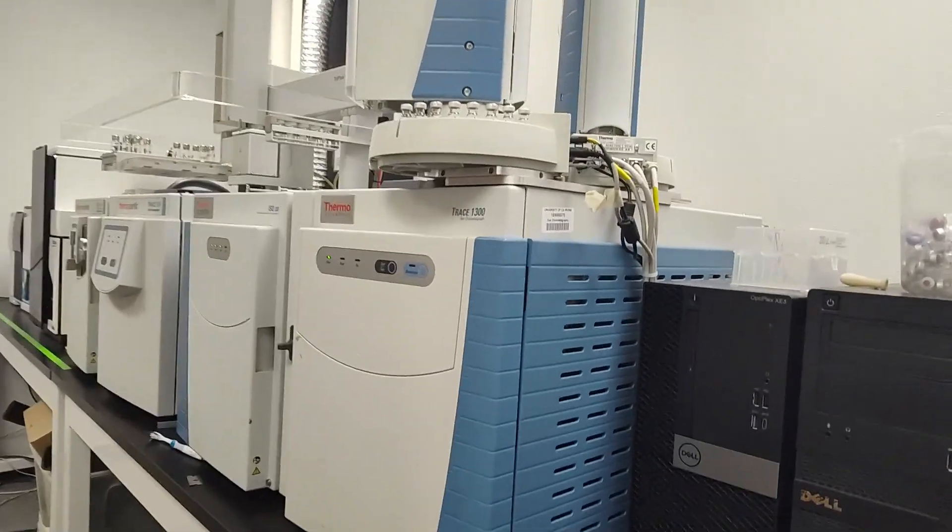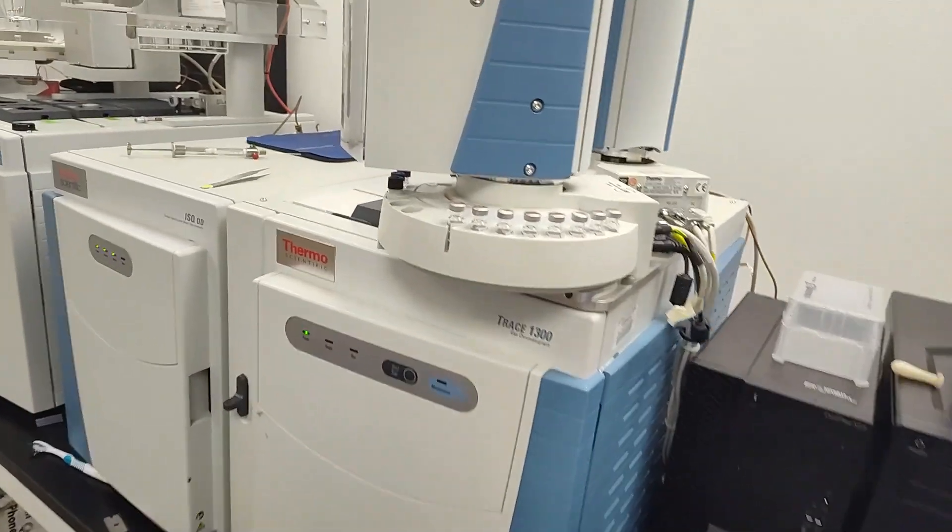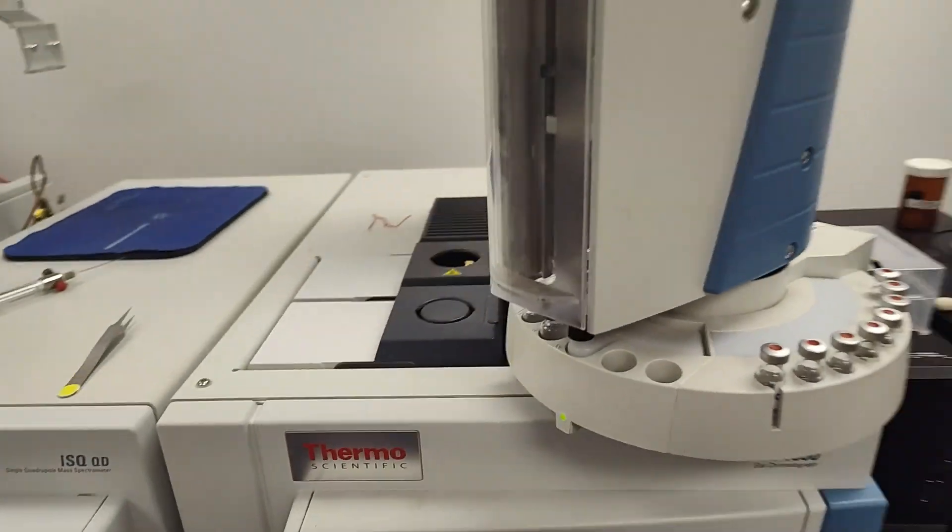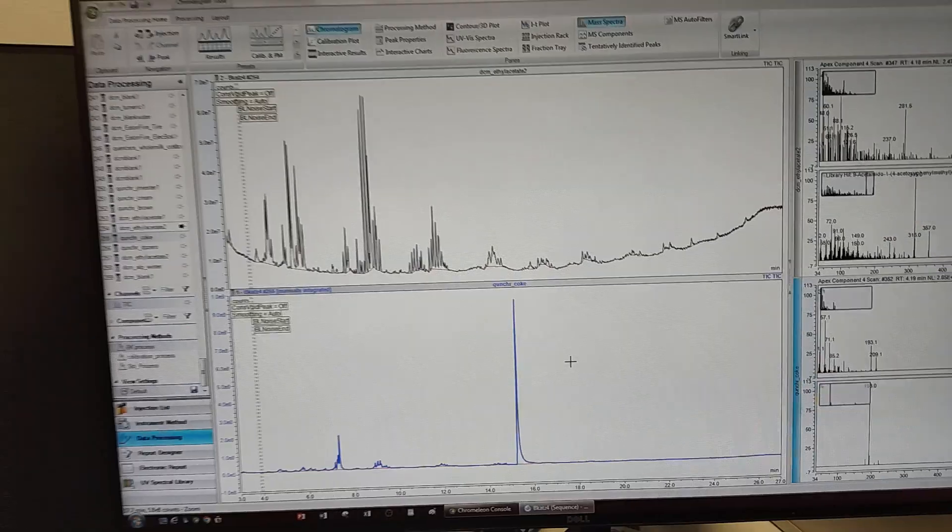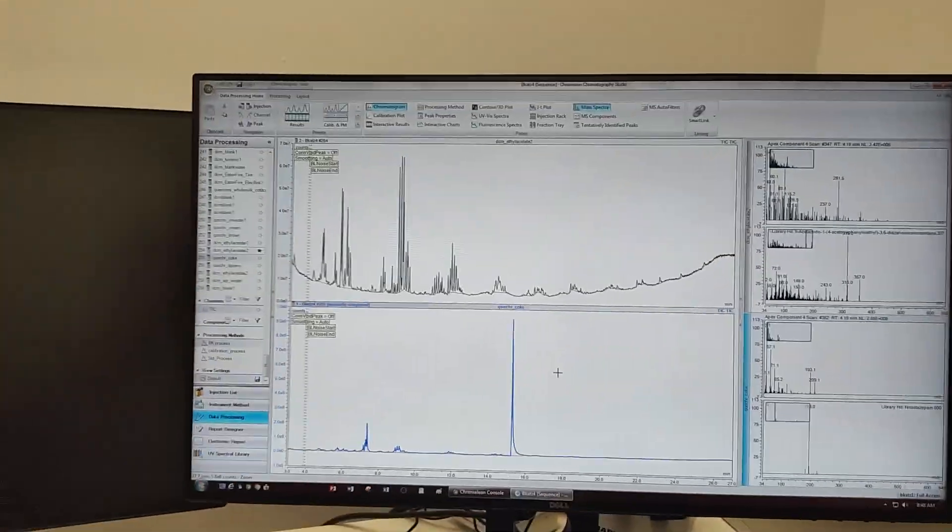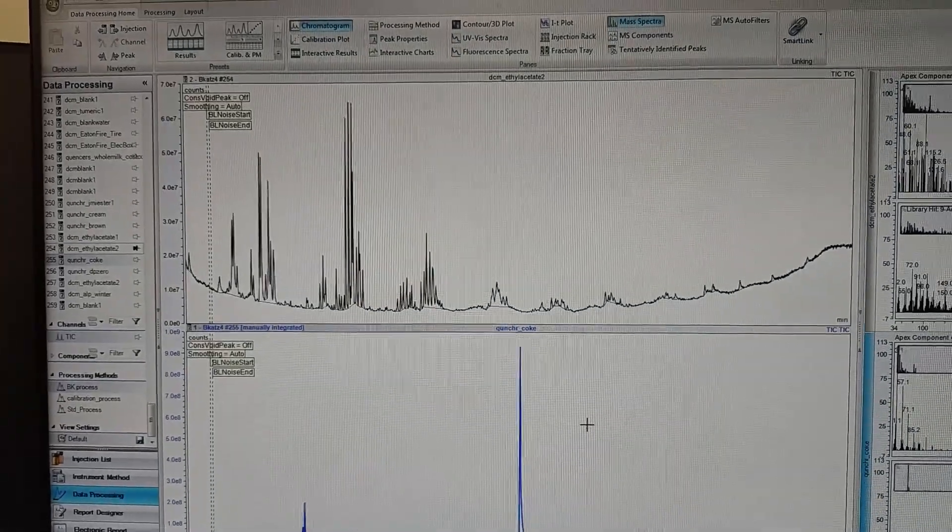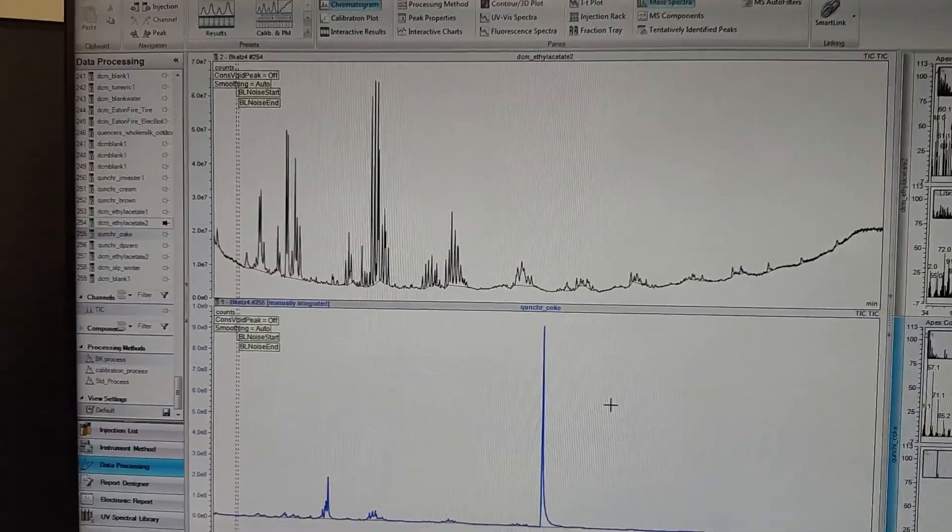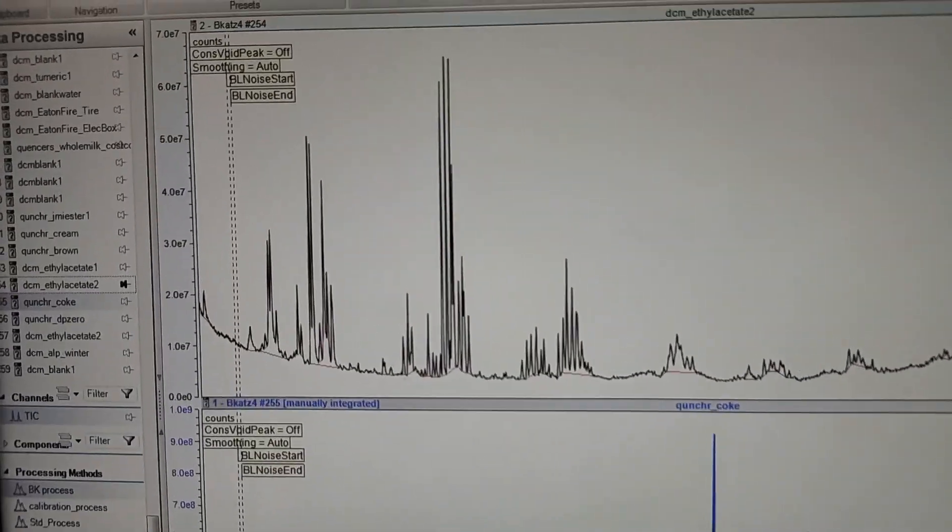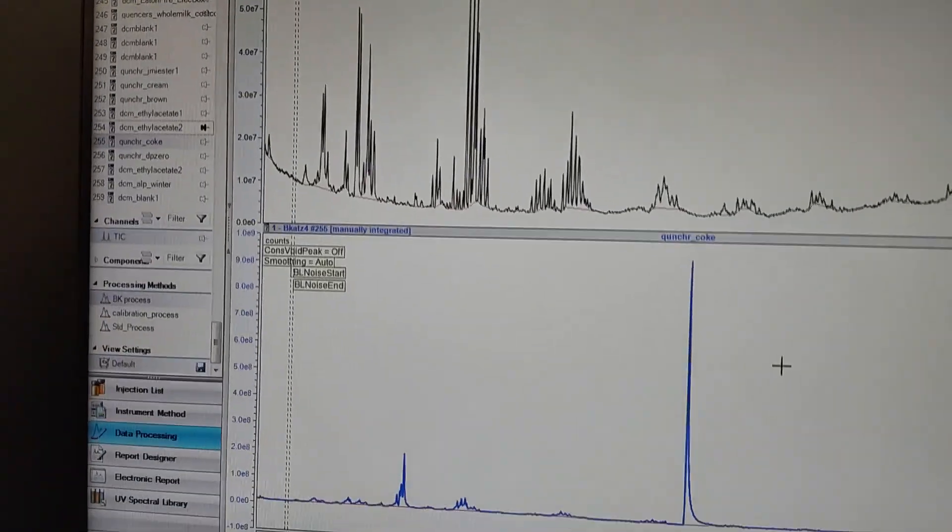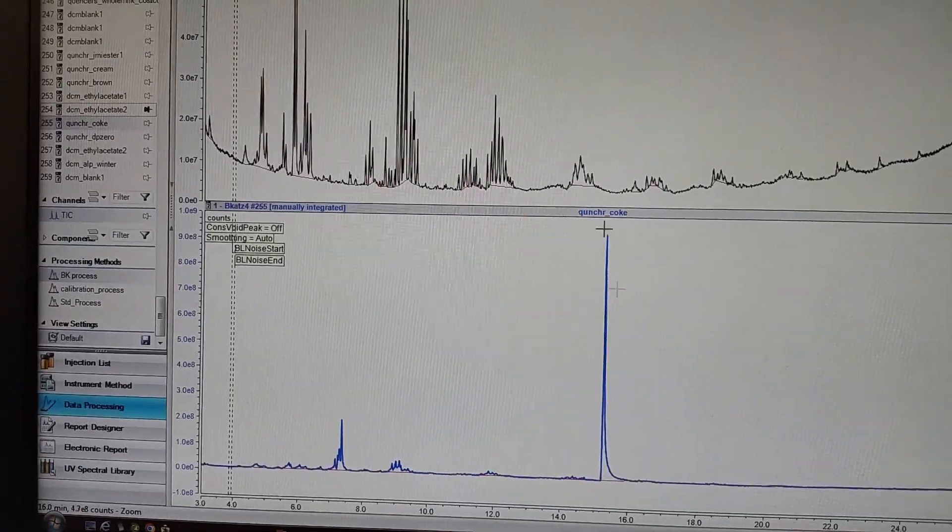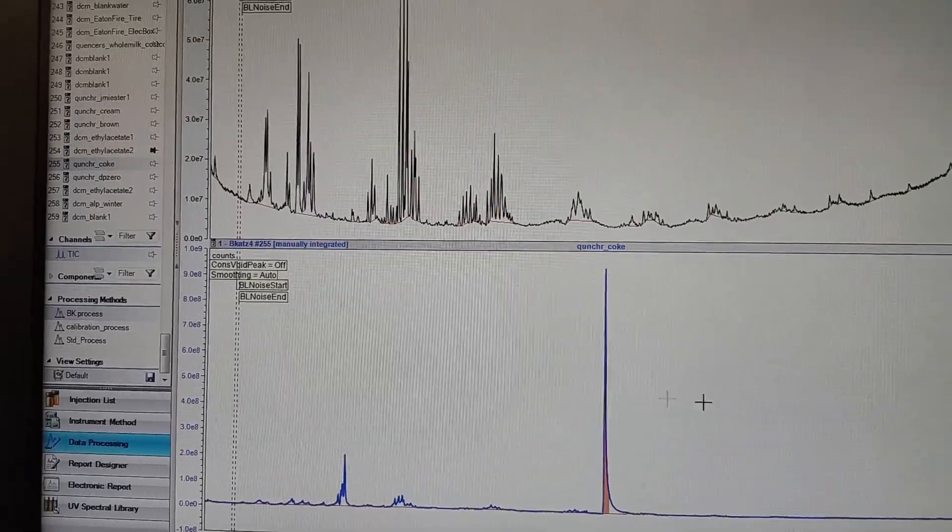This is the quenchers-prepared Coca-Cola on the GC ThermoTrace. We got the data here, but my biggest problem is I need to get cleaner ethyl acetate or something. The signal-to-noise is way different, but that's the whopping caffeine.